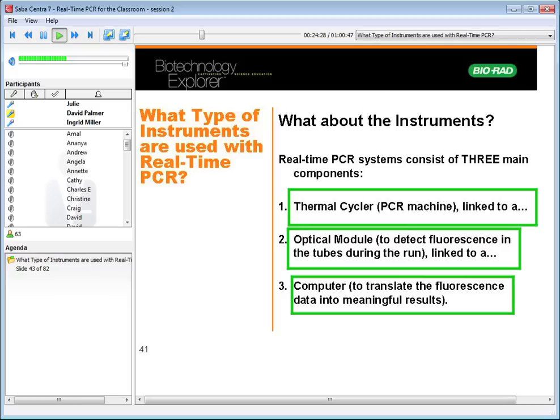Plateau height, I alluded to this earlier, but it really doesn't matter. PCR reactions just double and double, and where they finally end, it can vary over a medium range. So we don't worry about the plateau height. It doesn't have to be the same. The curve should be smooth, and the melt curve should have only one product.